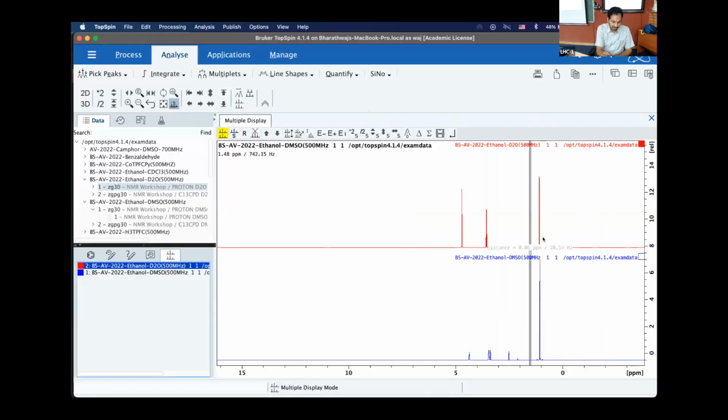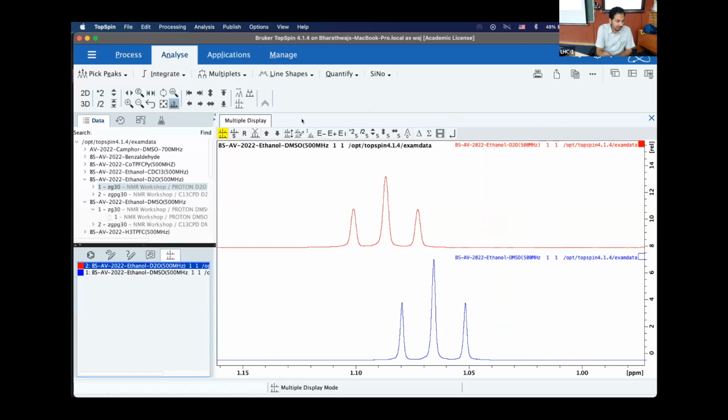Let's go back to the practical aspects, and the scalar coupling wouldn't change much. So let's try to measure it. What was the scalar coupling in the case of... so that more or less remains the same, 7 Hertz, and it remains 7 Hertz here as well. So things don't change much in terms of scalar coupling. Scalar coupling changes indicate dihedral angle changes. So here it's more electronic environment change than dihedral angle change. Does that make sense? You will see more of it as you go forward.